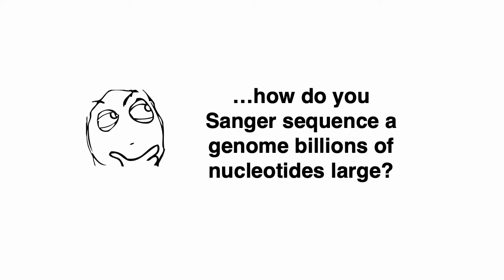And so I mentioned earlier that generally speaking, you can't sequence a whole genome all in one go. And it should be pretty obvious from the previous slide why that is. If your genome sequence is say 3 billion nucleotides long, it's not like you can run a gel that has a few billion bands on it. And modern day Sanger sequencing doesn't use gel electrophoresis. They do Sanger sequencing within microwell plates. But even then, it's basically impossible to Sanger sequence an entire genome all in one go.